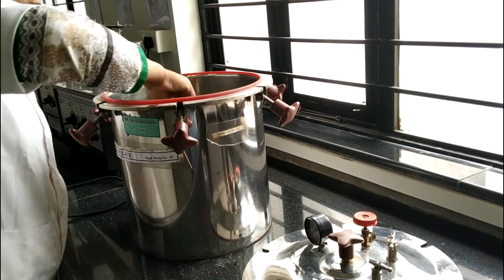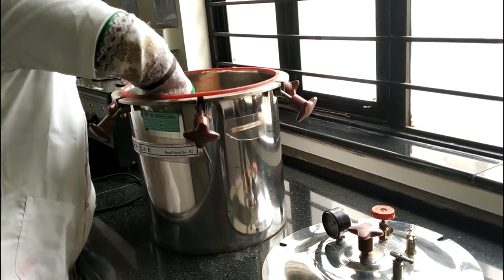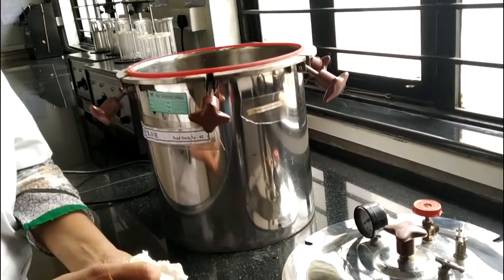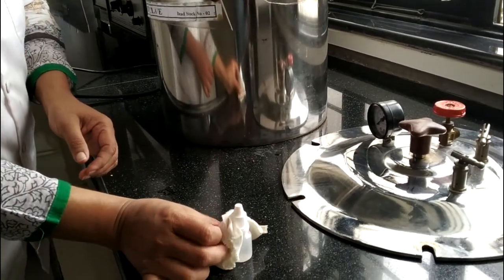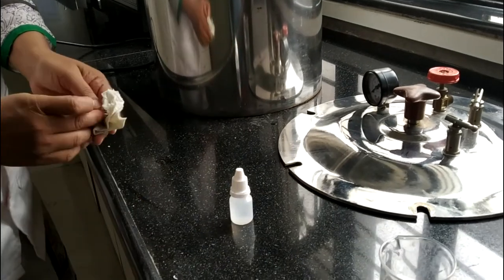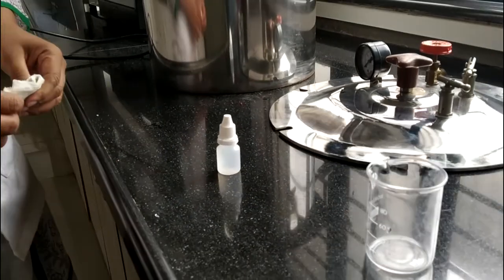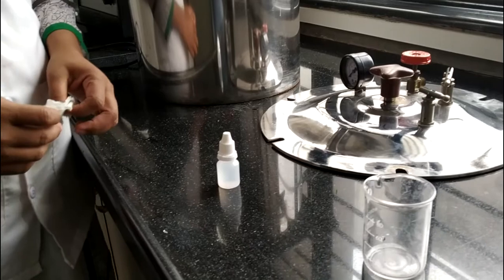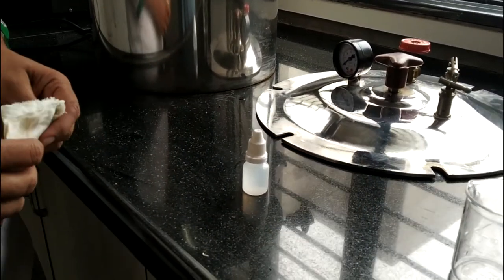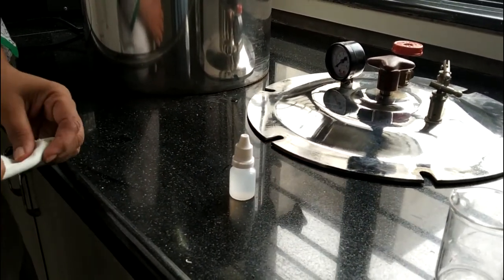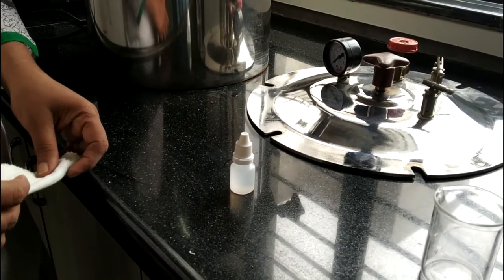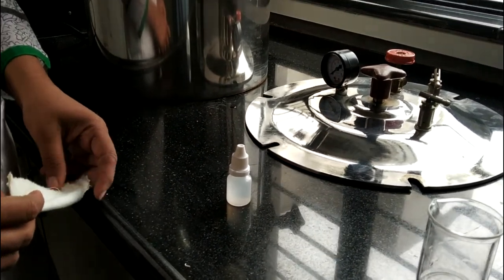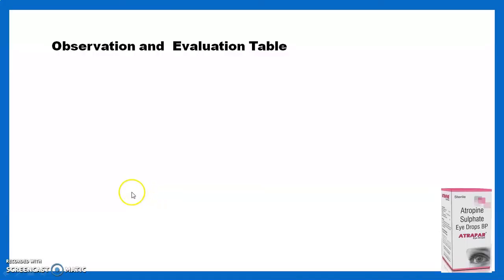Remove the eye drop's final container from the autoclave using cotton or cloth. In this way, our sterile atropine sulfate eye drop is prepared. Now for the evaluation and labeling, we move toward the next session. After going through the stepwise procedure in the laboratory, we move toward the observation and evaluation table.